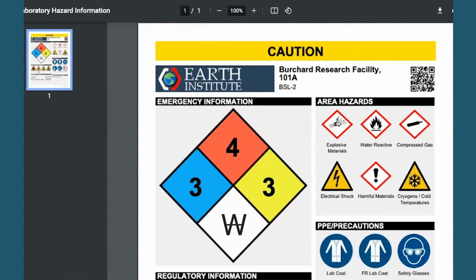So if I have any questions about how this space or the other hazards that are present, I want to get to the phone numbers to make those actionable. As a member of our health and safety team, I can scan that QR code and pull that information up, or even start an inspection on the space right from there. So it's a lot of action.